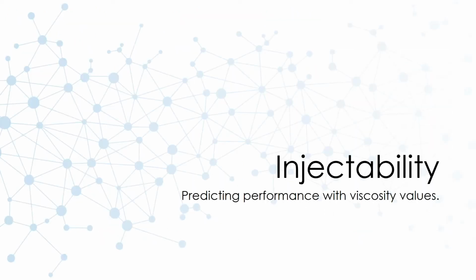Okay, so that sort of ends the section on talking about the dilute solution viscometry and trying to not only extract meaning from that, but also use those parameters to extrapolate to higher concentrations just for convenience purposes. Now we're going to shift to something more applied. I had mentioned that one of the important reasons for measuring viscosity is that you can have situations where it's directly applicable to how you're using your product. And so in this case, we're going to talk about using the viscosity values to predict the injectability.